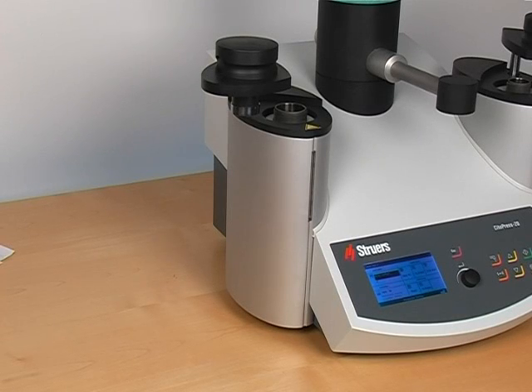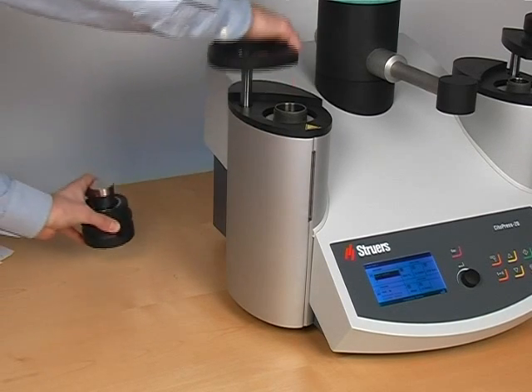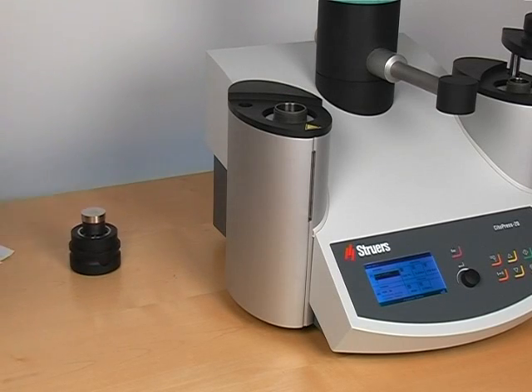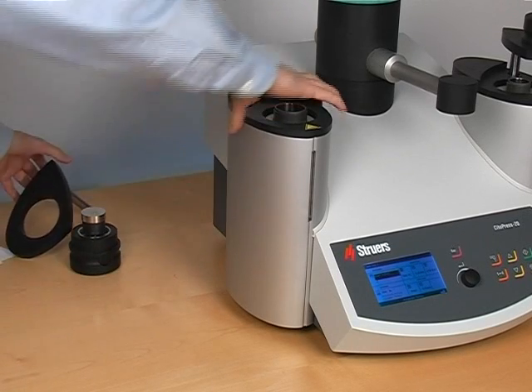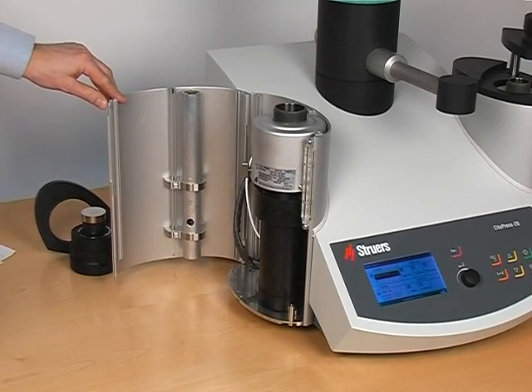Speed is great, but mounting can be quite messy — we thought about that too. The mounting unit is conveniently located on the side of the press. In this fashion, we minimize the cleaning job you have to do. Getting access to the vital parts of the press is as easy as it gets. Simply remove the top cover and the mounting tower splits open into two for full, unrestricted access for cleaning and change of mounting unit.